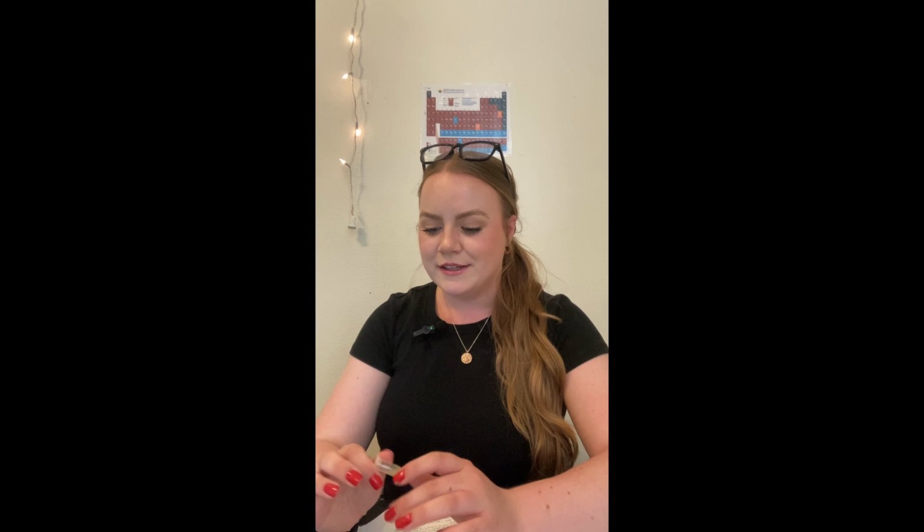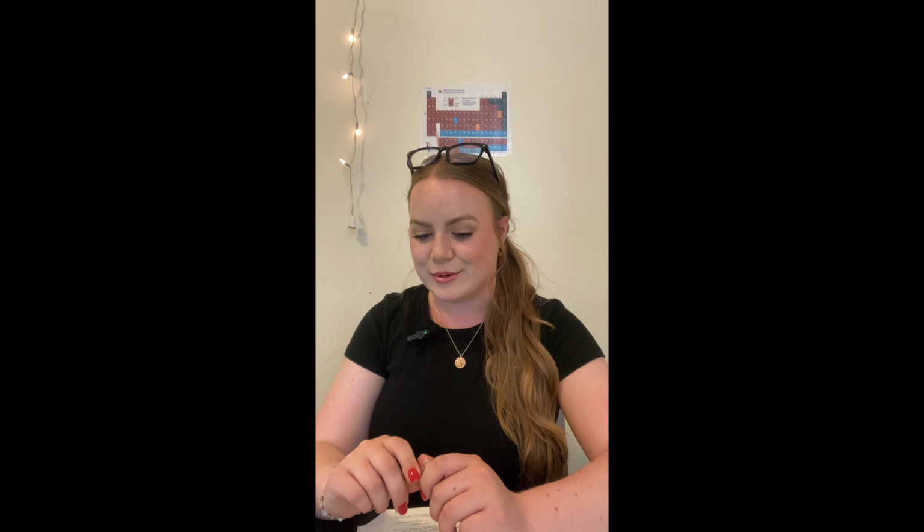I've kept these in the refrigerator because I don't have amber bottles to protect the organic, so they've stayed cold until I've been able to use them for today. So I want to go through these and tell you what they are, the main forms of vitamin C that are in them, and then we'll set up the titration and see what happens.